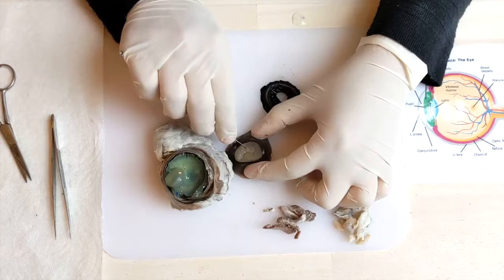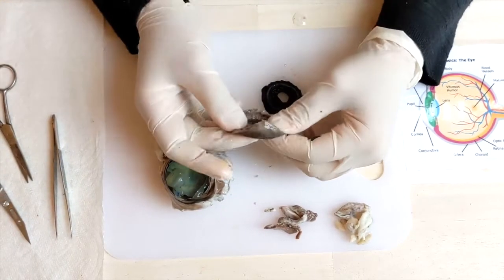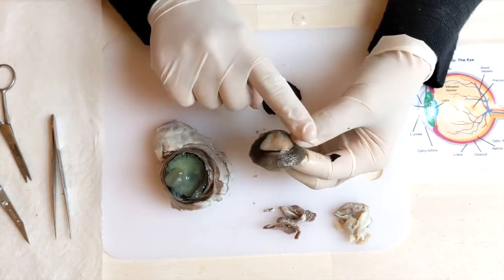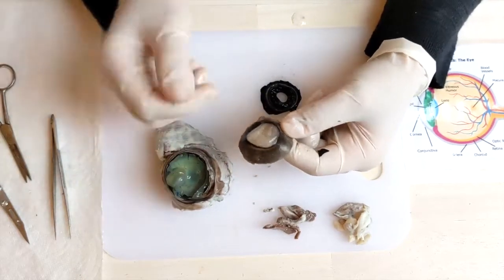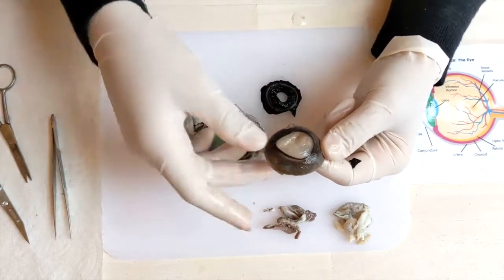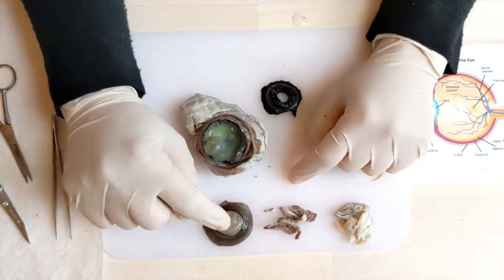Why do you think the cornea is very strong? I think it's strong so it can protect your eye from other stuff. Exactly, because it's like the protective layer of the eye. If this is weak, anything could actually get inside your eye, right? Like sand. Exactly, sand or anything could actually poke your eye, and that would be a big problem. So this is called the cornea, and this is the protective layer of the eye.